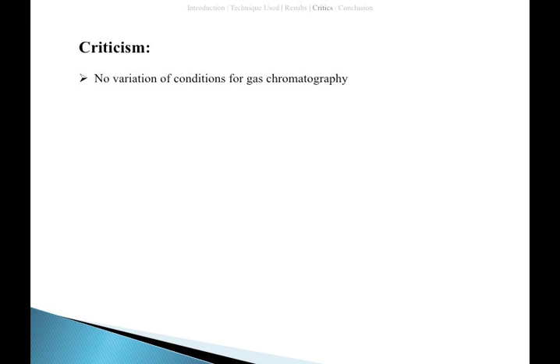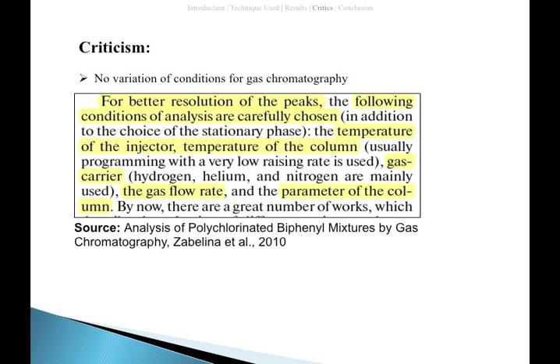The first point for criticism would be that there is no variation of conditions for GC analysis. The conditions mentioned earlier are the only conditions stated in the paper. However, another source states that GC analysis conditions such as temperature of the column, gas flow rate and carrier gas are vital for better resolution of the peaks.